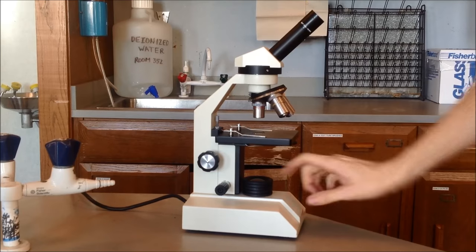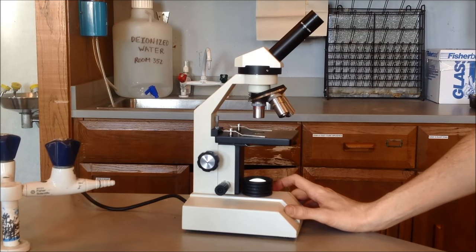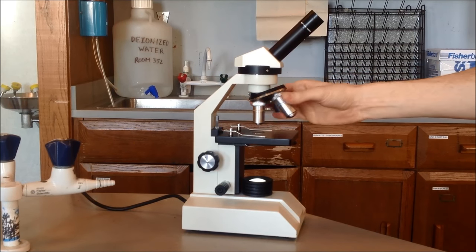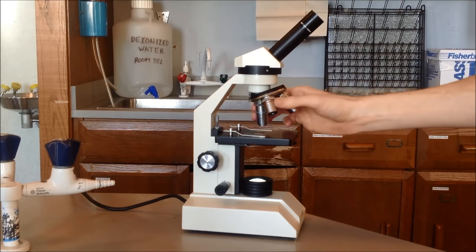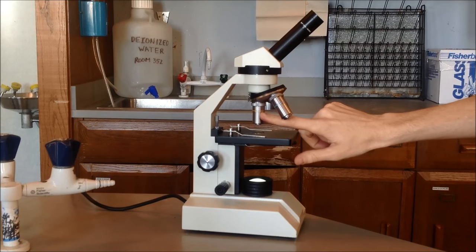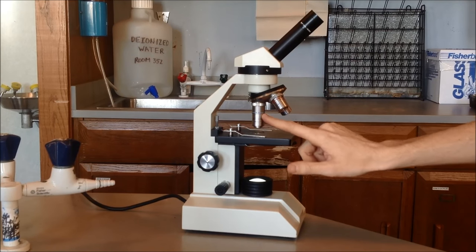The lamp is right here. There's a switch on one part of the base. It turns the lamp on, like so. The nose piece is this thing right here, which holds all three objective lenses. The red one, the scanning. The yellow one, the low power. And the blue one, or the high power.